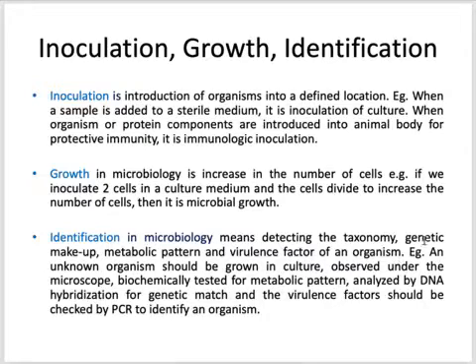By this sentence, the author wanted to describe how we can detect this. For example, you want to detect a bacteria and know what kind of bacteria it is. What do you have to do first? First you have to culture that bacteria, that means grow that bacteria. Then you have to observe it under microscope. If you observe it under microscope, then you will know what shape it has, what type of bacteria it is. You will have some idea. Then you got the morphology.